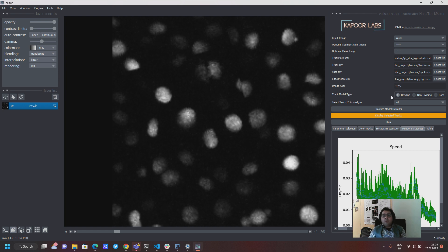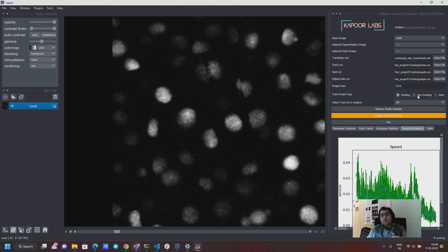So you can have only dividing tracks being analyzed in one analysis or non-dividing tracks being analyzed in the other analysis.